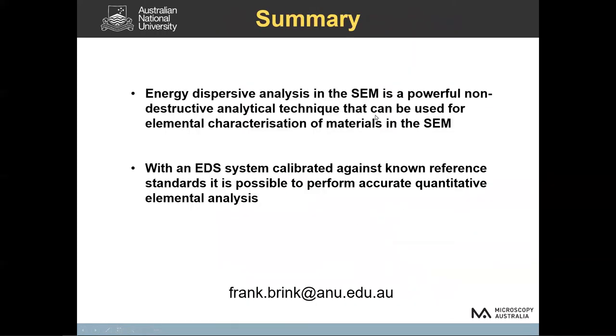So to summarize, energy dispersive analysis in the SEM is a very powerful, non-destructive analytical technique that can be used to explore the characteristics of your material in the SEM. If an EDS system is properly calibrated against known reference standards, it's possible to perform very high quality quantitative analysis.